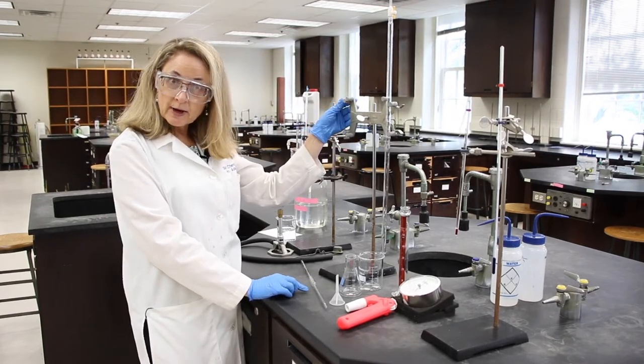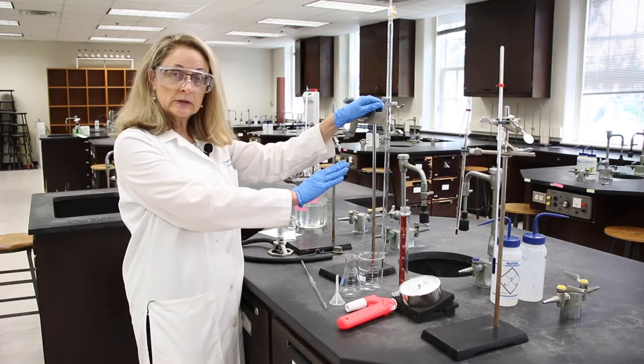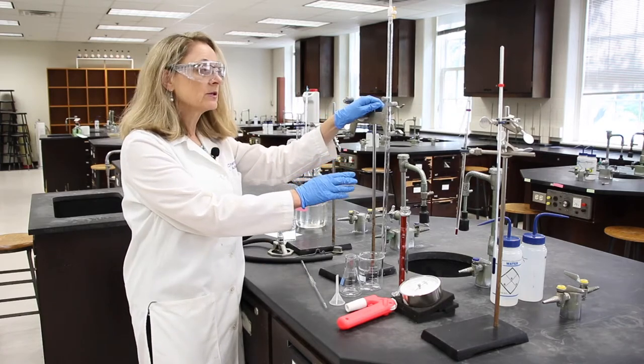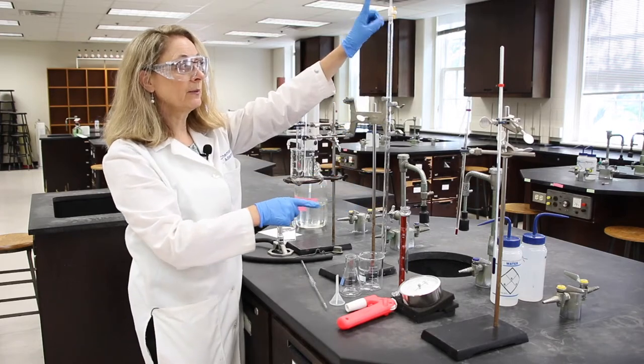I have the burette and a burette clamp. One thing that we'll learn as we go through the semester is that when a burette is upside down, so the tip is up.